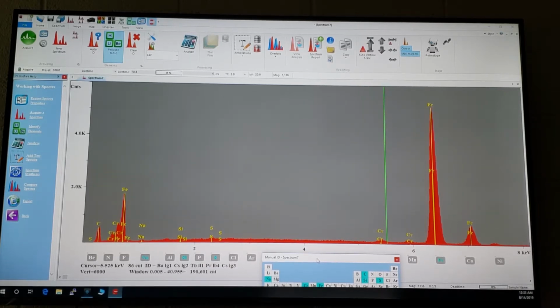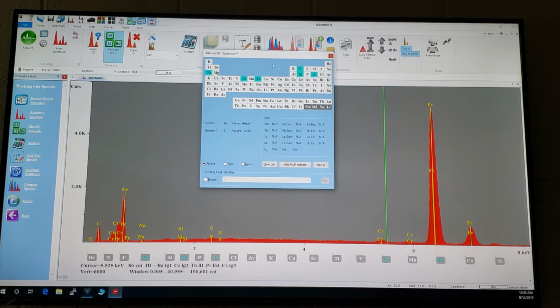In this case, I see sulfur, silicon, sodium, I don't know why. Fingerprint? Salt probably. Iron, but it's not hitting, there's a little chrome peak there, but I don't see a moly peak or a nickel peak, and I know that has it. And you know what's in there. That's right. So now, after the auto ID, you'd think, well, we missed some stuff.